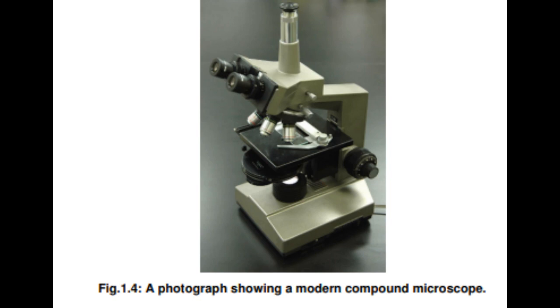Parts of a microscope. A microscope mainly consists of many parts. These include an objective lens, ocular lens, lens tube, stage, and reflector. An object is magnified through the objective lens. When the target is focused, a magnified image can be observed through the ocular lens.